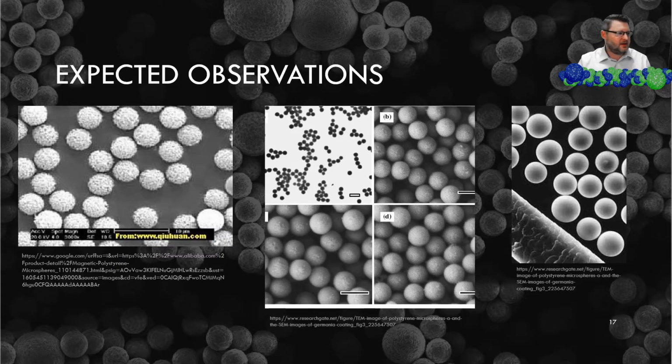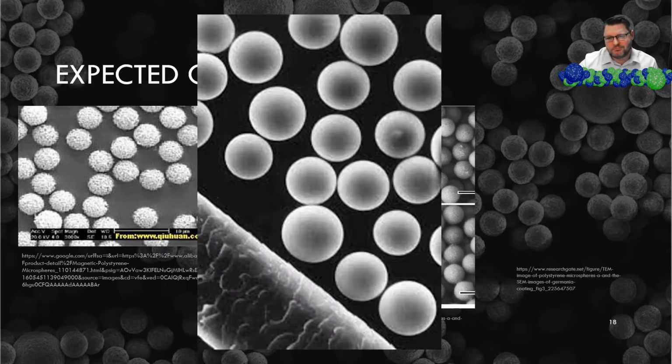Okay, so first, my expected observations. Whenever I look online at Sirtex, really any kind of microspheres of any kind, these are the images I see. To me they're relatively poor, grainy. They just kind of look like out of focus little balls. If you look at this one real close, they might have used some kind of carbon background for it, but it almost looks like it's photoshopped. I believe those were Theraspheres, but I'm not 100% on that.